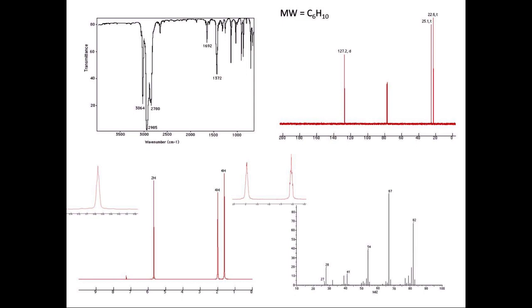And what we could think about are 2 structures. Oh, I should mention the mass spec. This here is our molecular ion. And this here is our base peak. Not the same. Base peak is going to be the highest peak. The molecular ion is going to give you your molecular weight. So this is the radical cation. Based on all of this data, we can come up with a couple of structures. We know we have a pi bond and we know we have a ring.